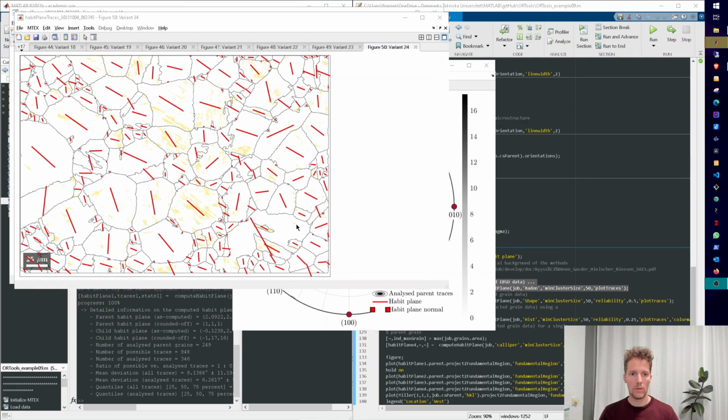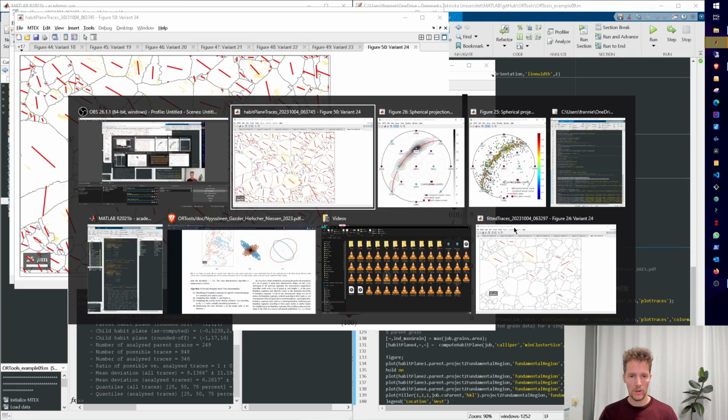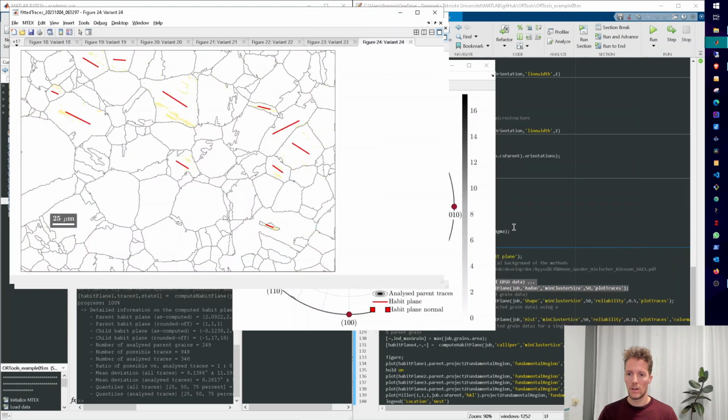So we've now gotten all our results here, plotted in all those tabs. There should be 4 figures in total. Let's start with this one. These are the fitted traces, right? And we can see that for each variant we have 1 figure, which can make this a little bit tedious to plot.